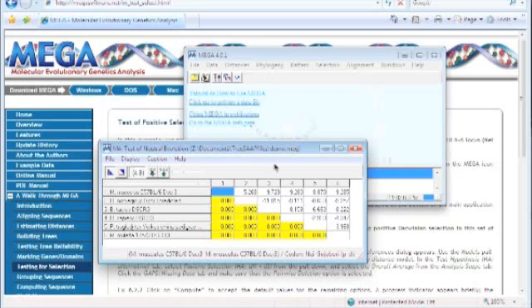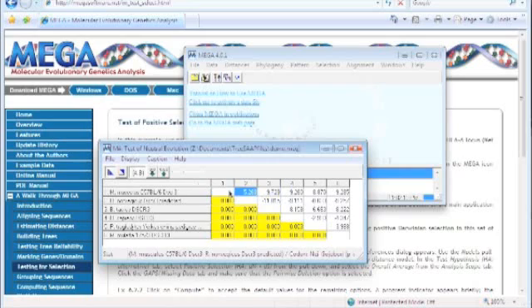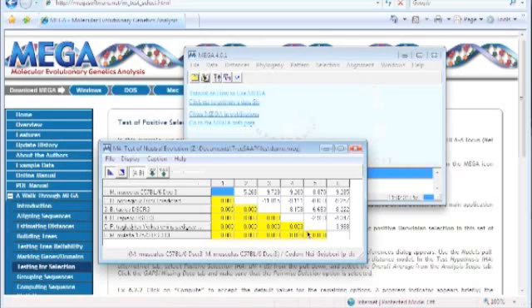Here we see values — we're basically looking at values below 0.05, which are significant in this bottom triangle. They're all highlighted yellow; blue is just the cursor. We see that the probability of there just being neutral — of there being the same amount of non-synonymous and synonymous mutations — is 0. So there's a very low likelihood of it being just random.